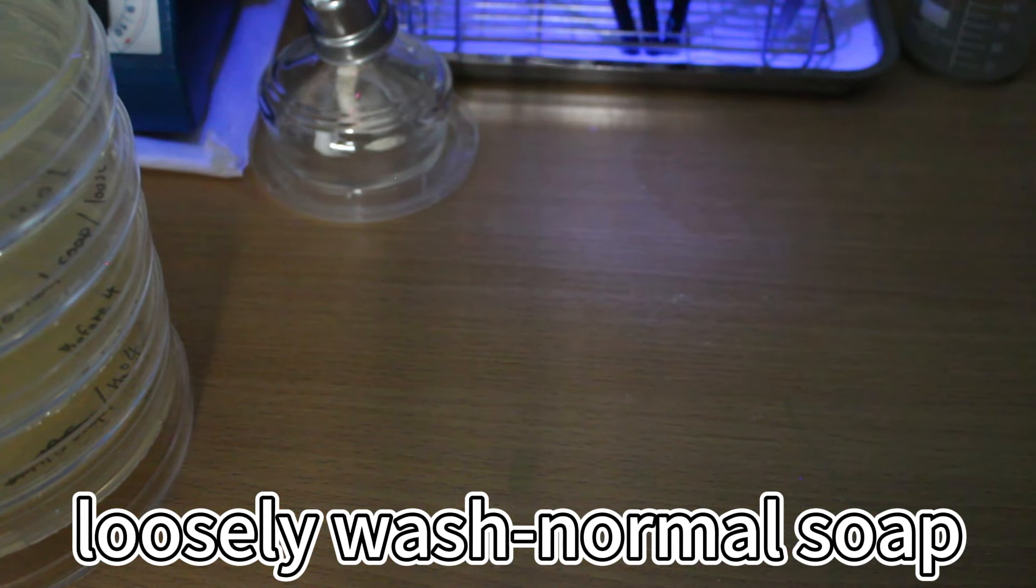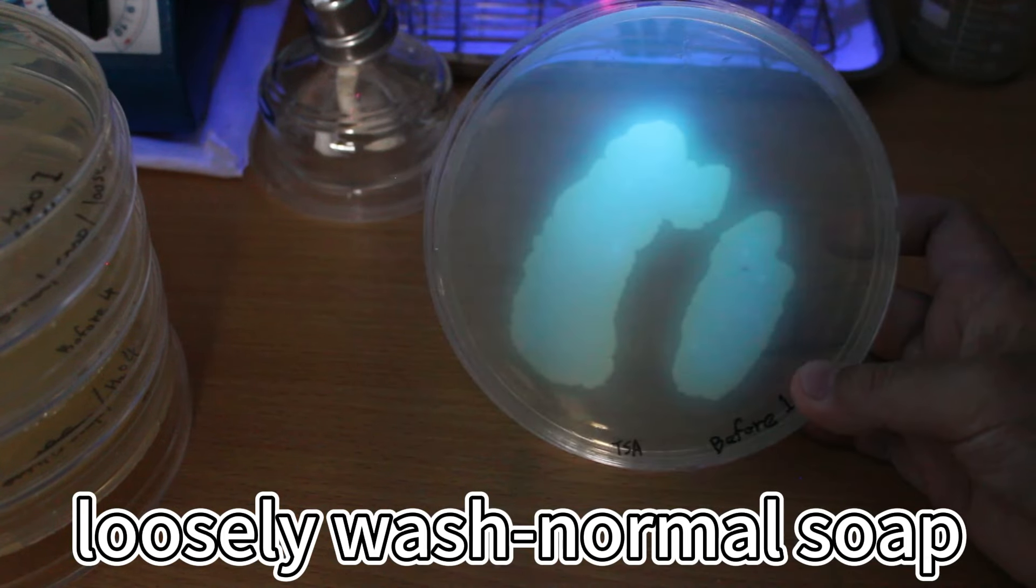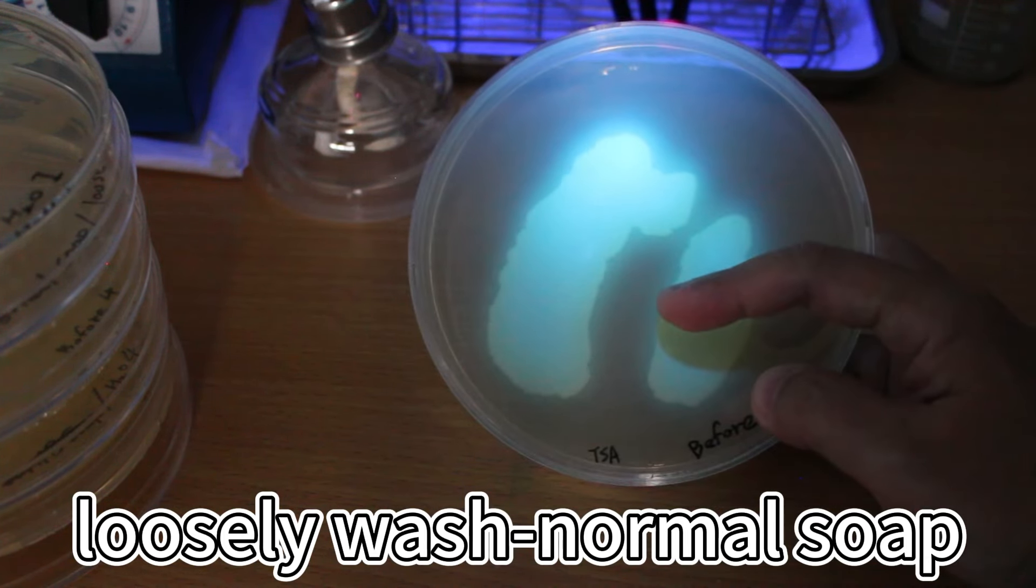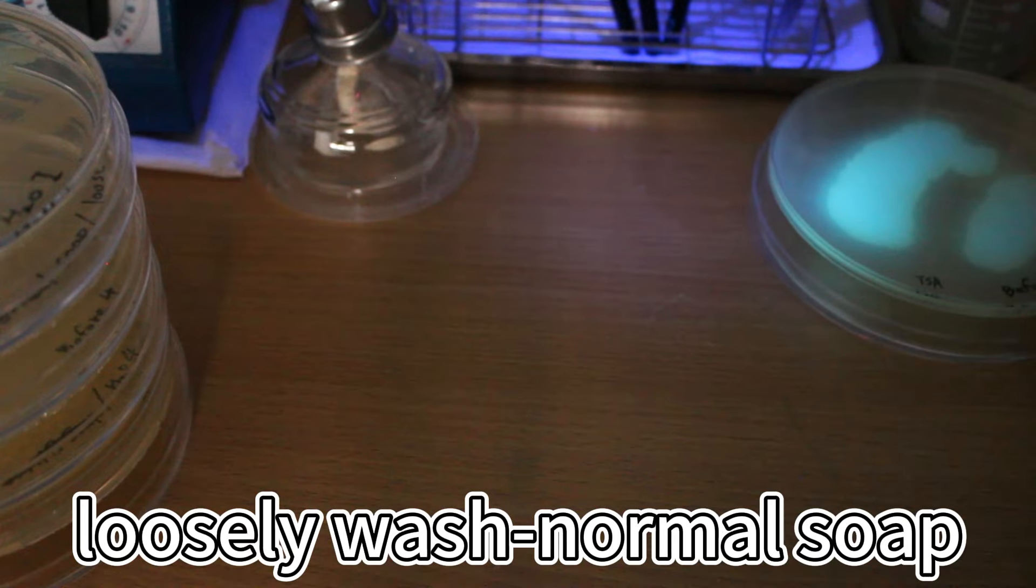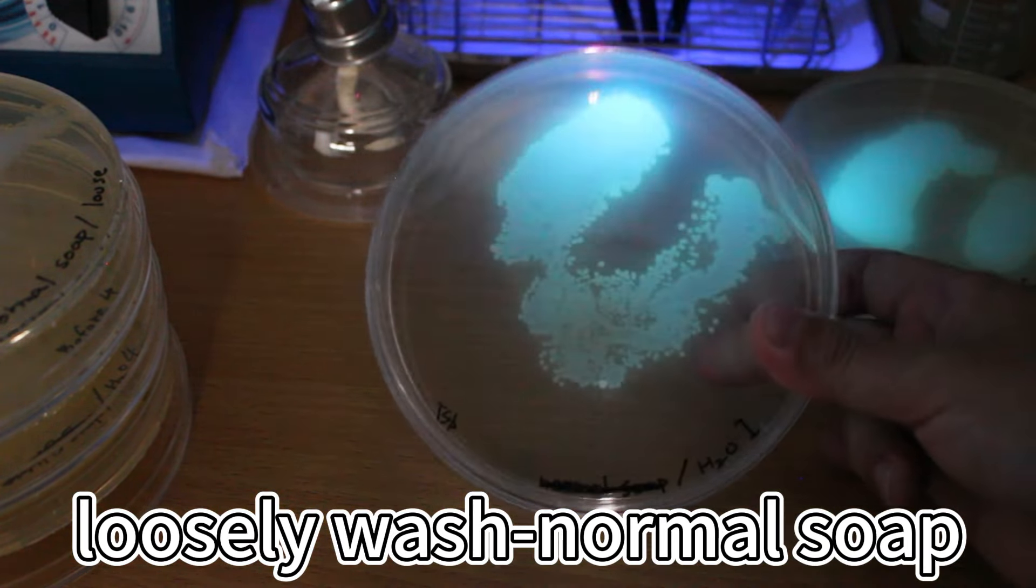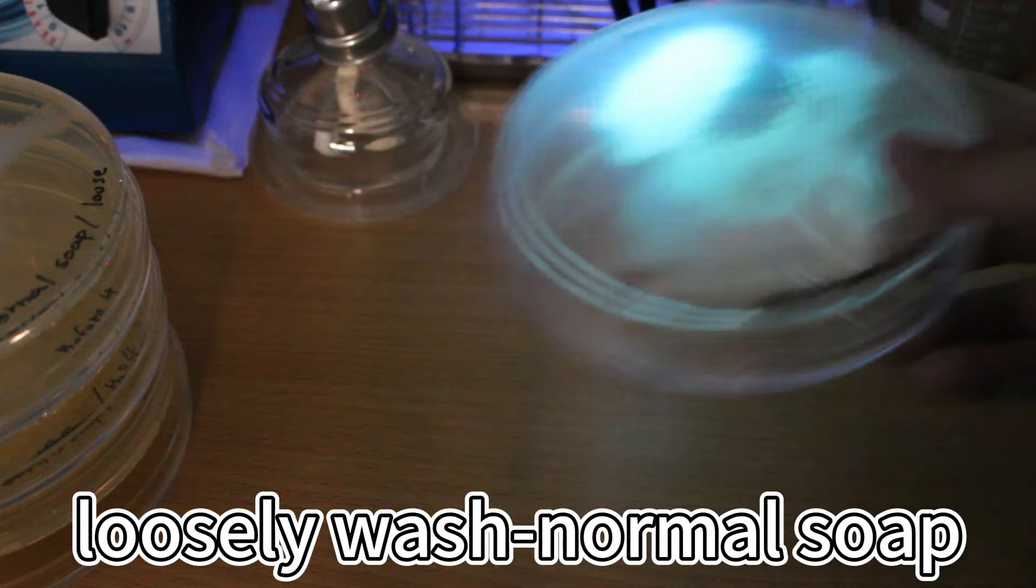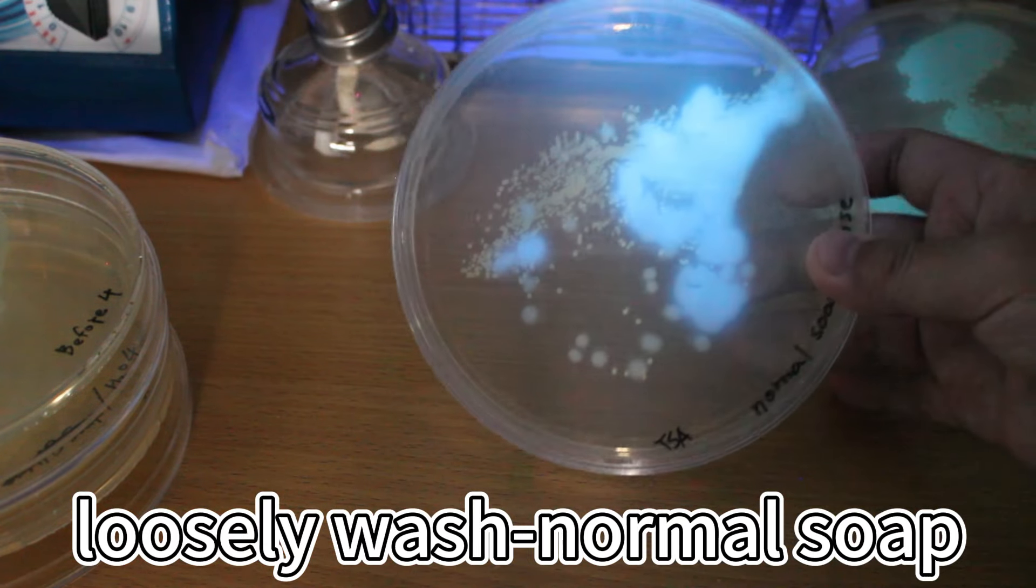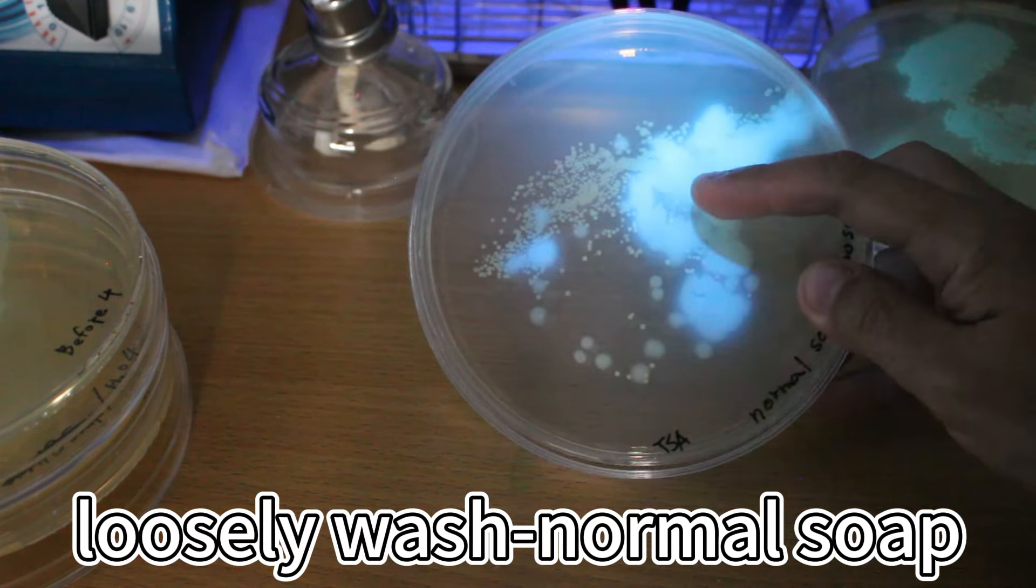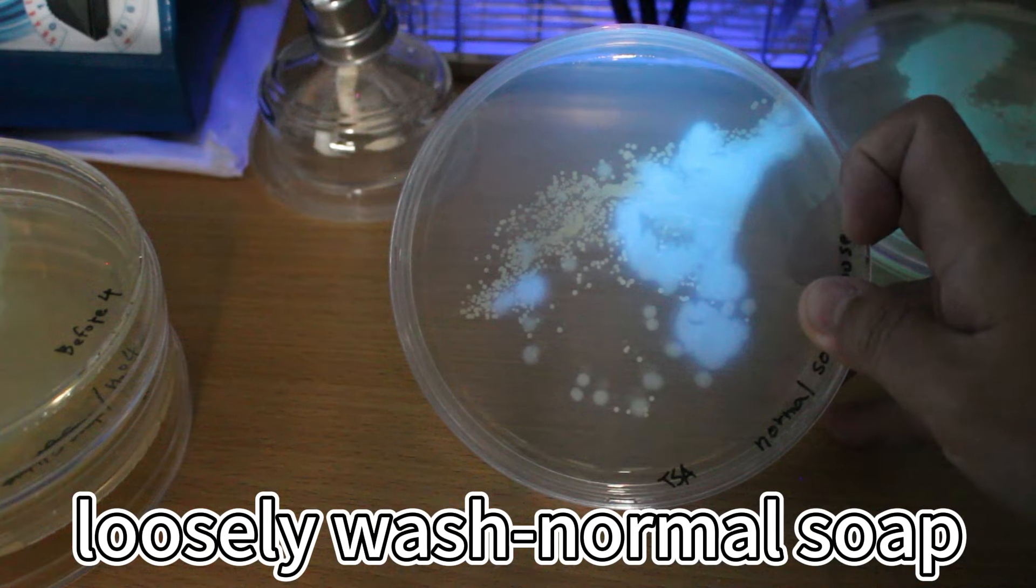So now let's look at the loosely wash group. This is the before wash, which I just put bacteria on my hand. And this is after water rinsing my hand. And this is after wash with normal soap. And you can see there are fairly amount of bacteria still there.